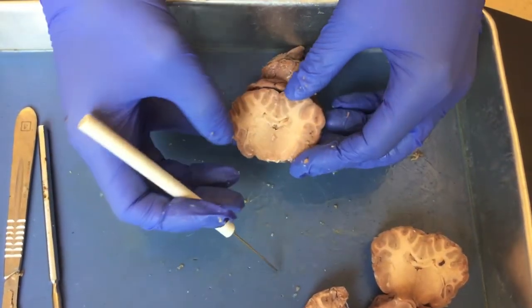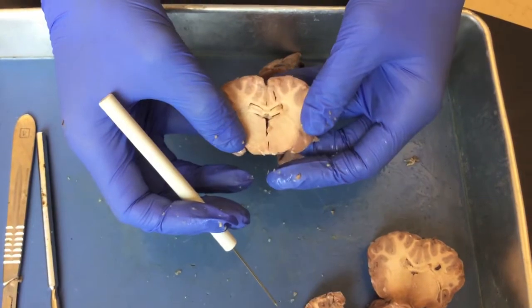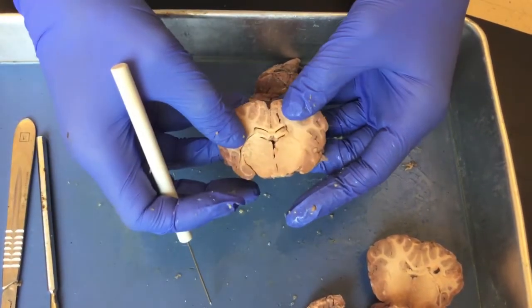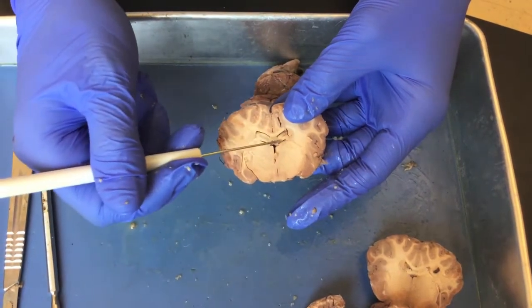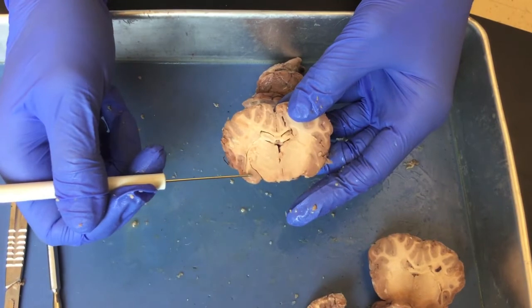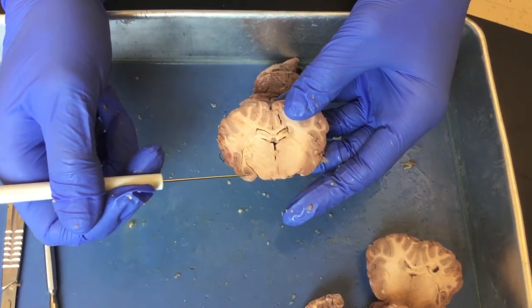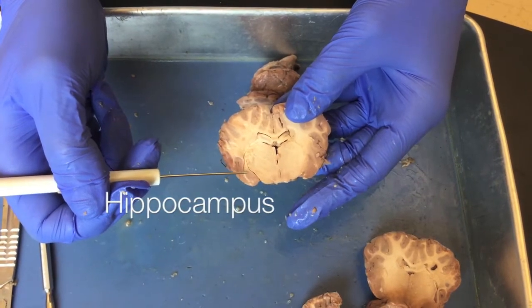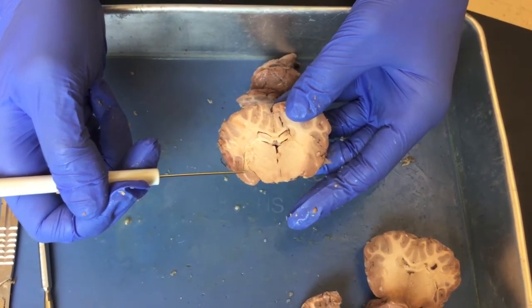Moving further posteriorly, we can follow the progression of the ventricles. We still have some third ventricle here, and we still have some corpus callosum here. You can also see the beginnings of a part of the hippocampus. This is one part of the brain that's very important for memory formation.